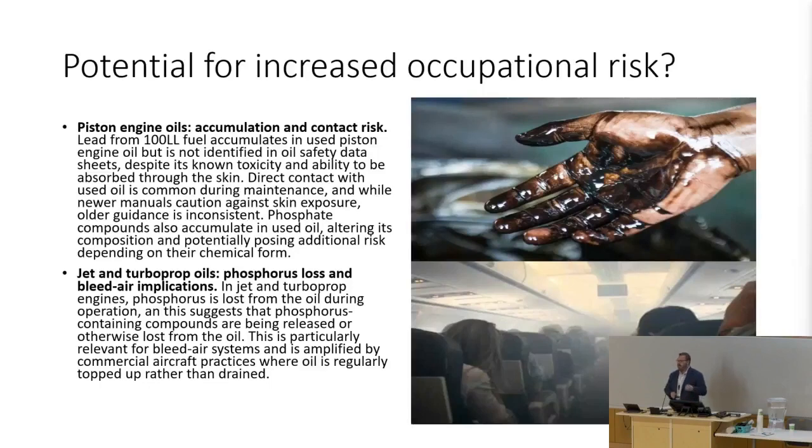That's compounded a little bit by the fact that, especially in large jet aircraft, I don't know if y'all recognize, but they don't really do oil changes so much. The oil burns off at such a high attrition rate that they can just kind of perpetually add. So to see the value go down substantially is something that is kind of outside the norm.